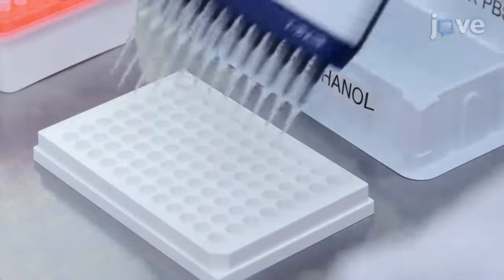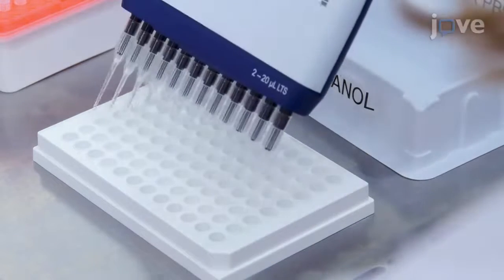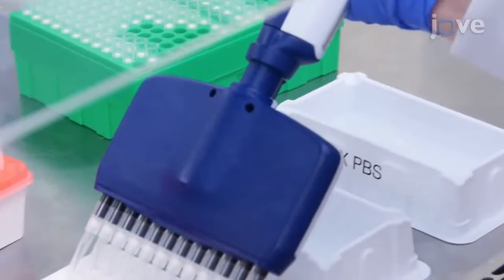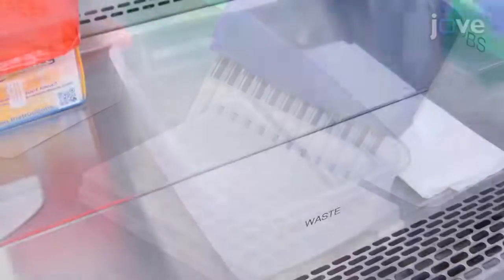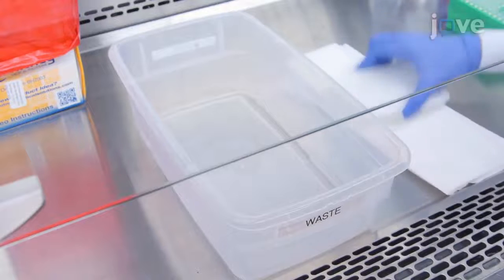To begin, add 15 microliters of 35% ethanol to each well of an Alicebot assay plate. After 60 seconds, add 150 microliters of PBS to each well and invert the plate to stop the ethanol pretreatment. Great care should also be exercised when handling the Alicebot assay plates to avoid contamination or damaging the membrane.